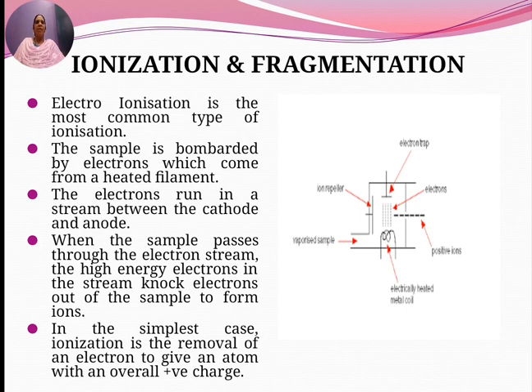The sample is passed through the electron stream. The high energy electrons in the stream knock electrons out of the sample to form ions.